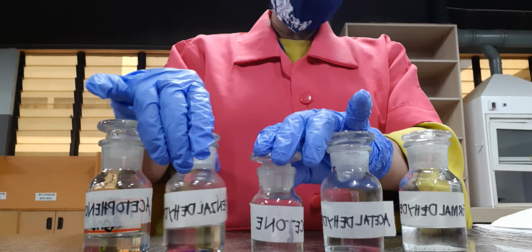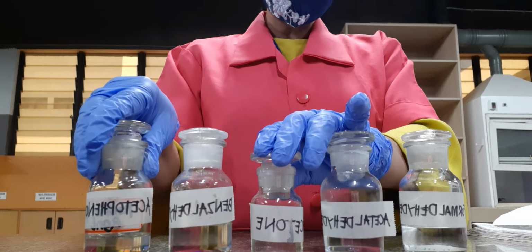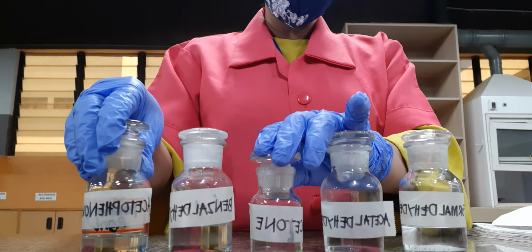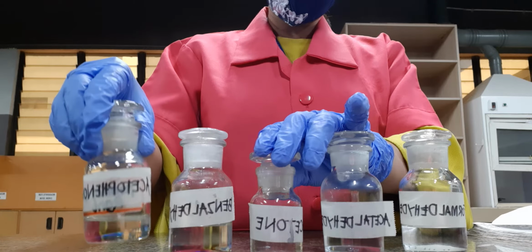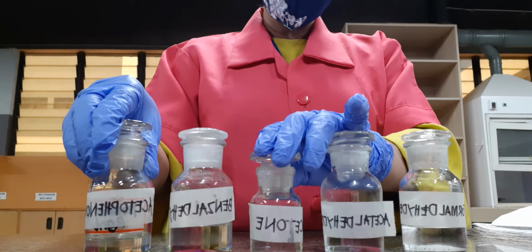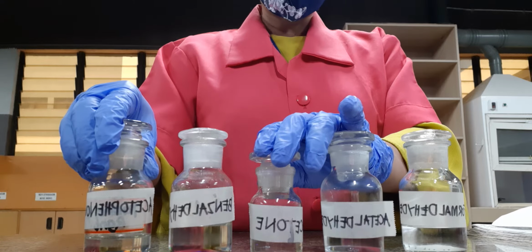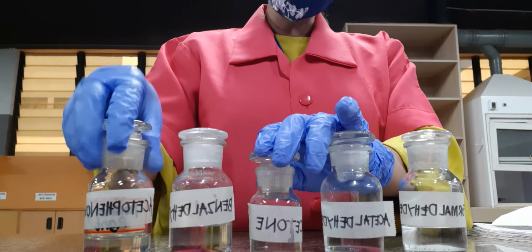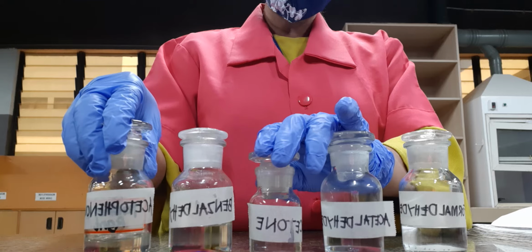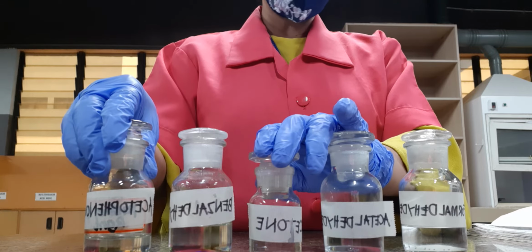Then we have the benzaldehyde, which is C6, an aromatic aldehyde, C6H5CHO or C double bond O and then an H. And lastly, we have the acetophenone, which is a common name for methyl phenyl ketone. So the common name is both the same, acetophenone and methyl phenyl ketone.